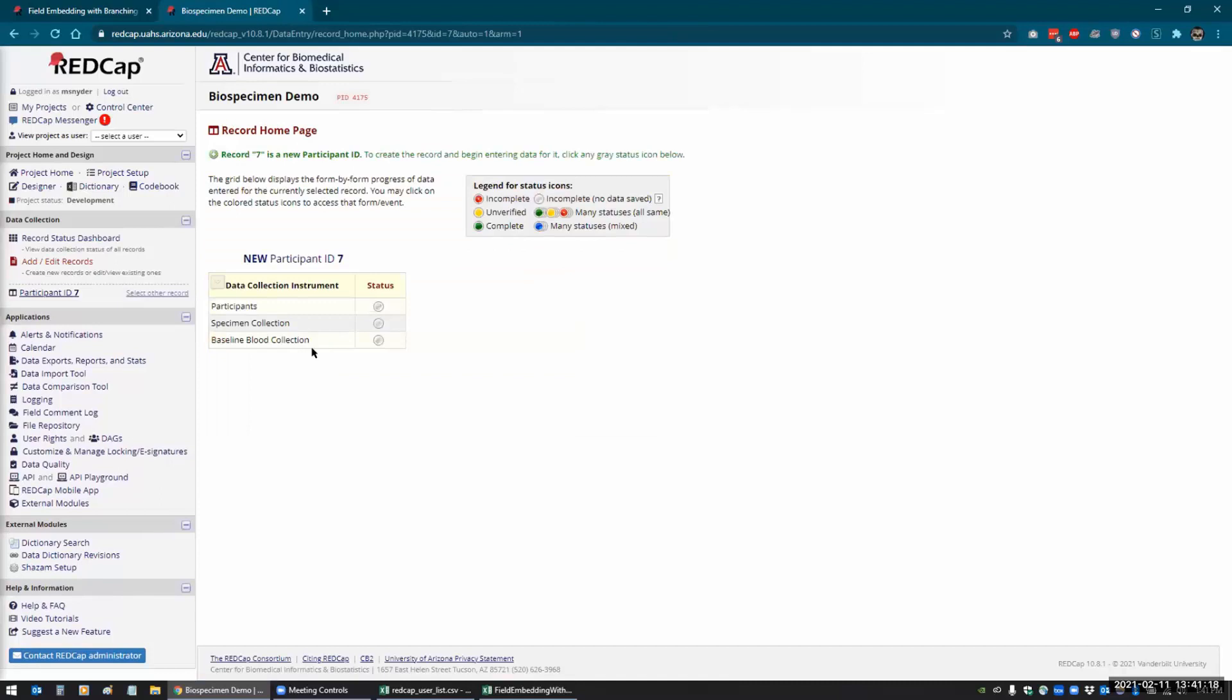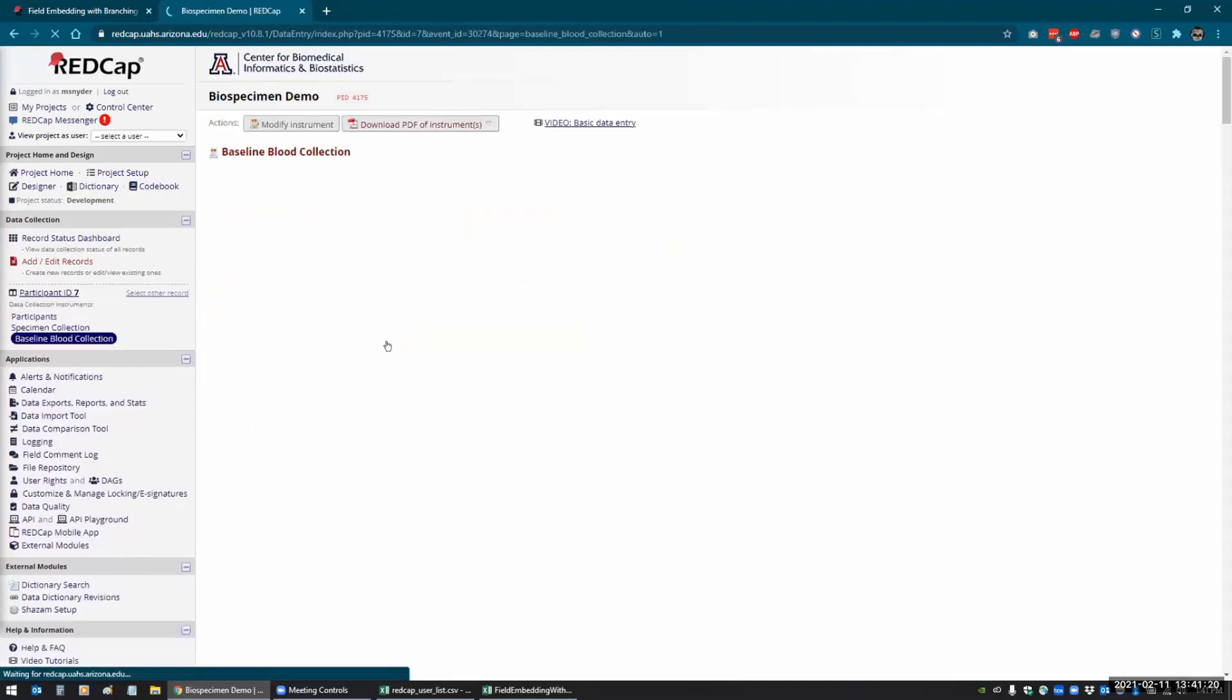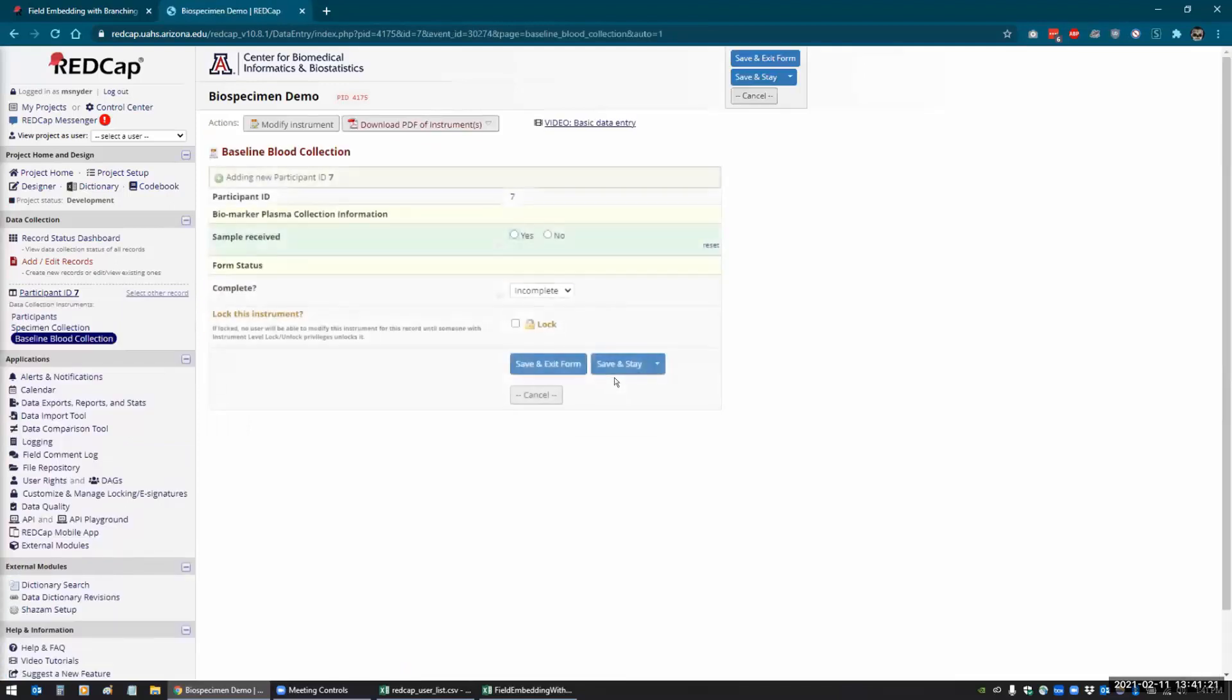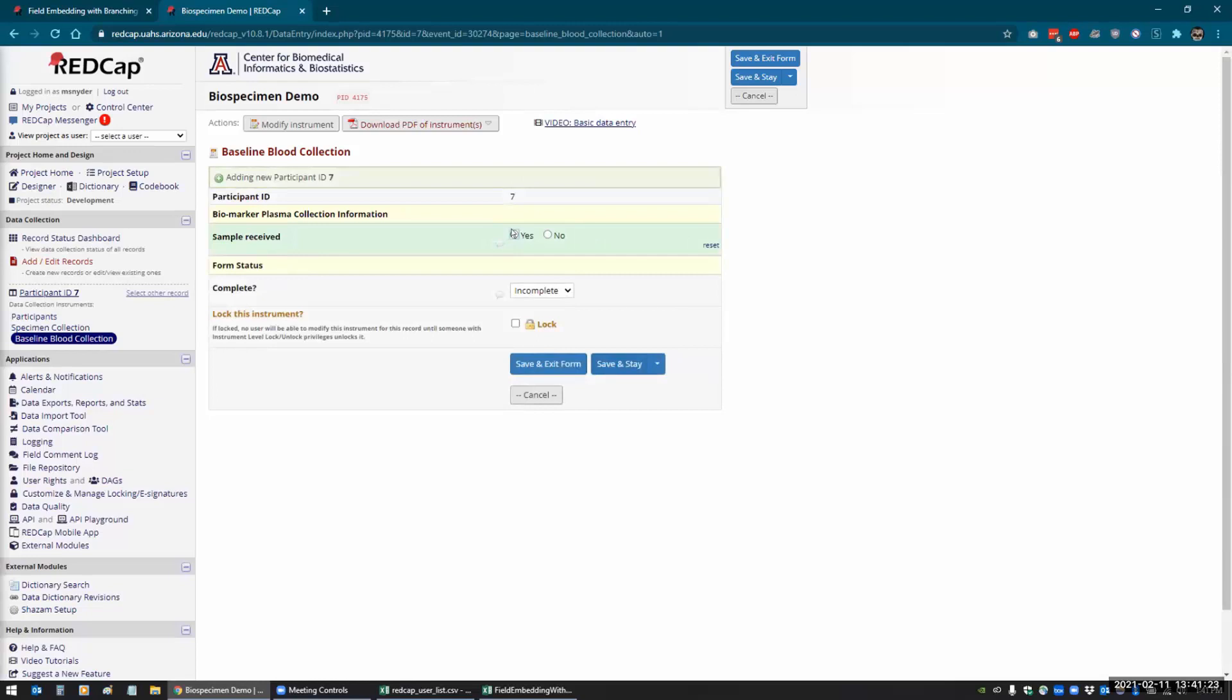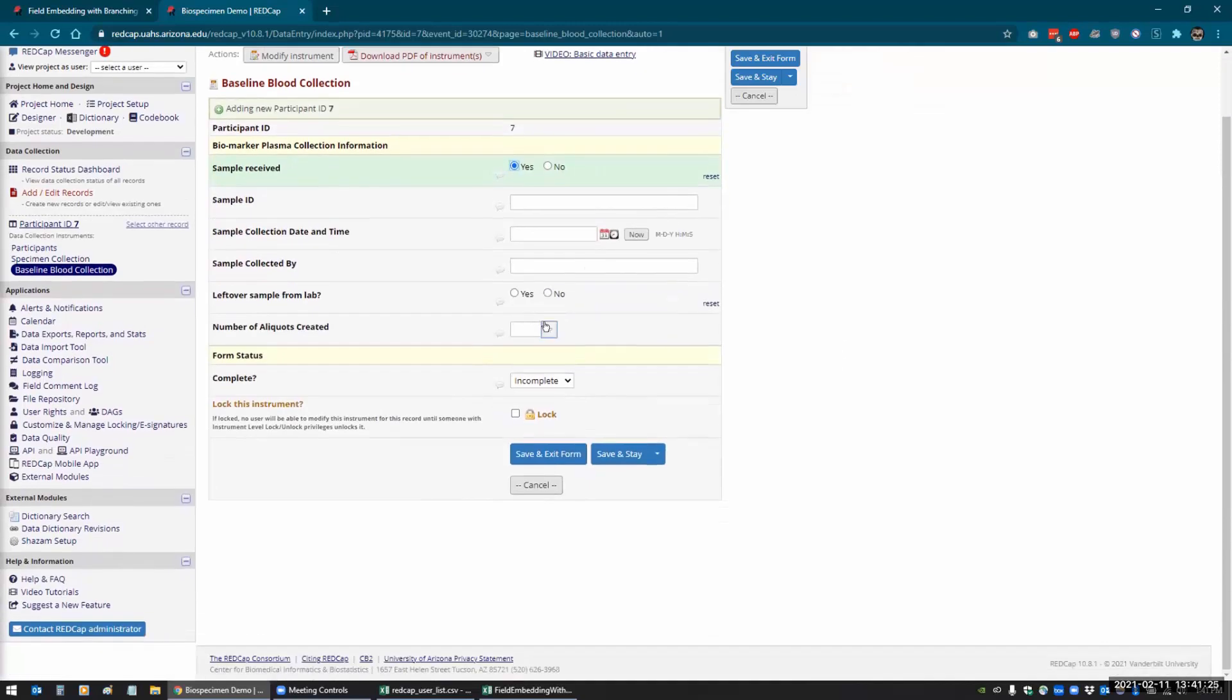So they wanted to collect specimens, and depending on how many specimens they received, they wanted to be able to enter the data for that many specimens.